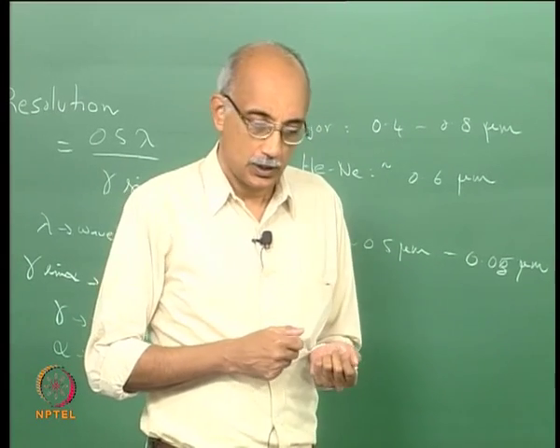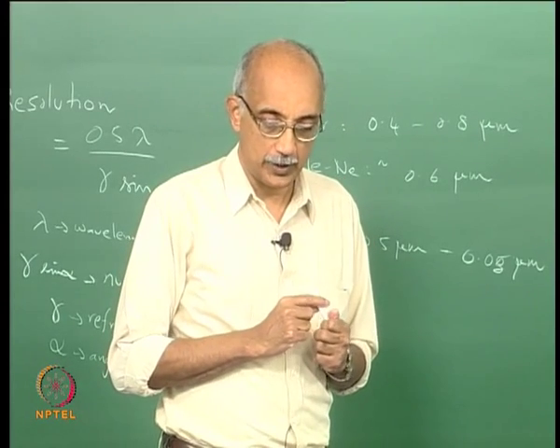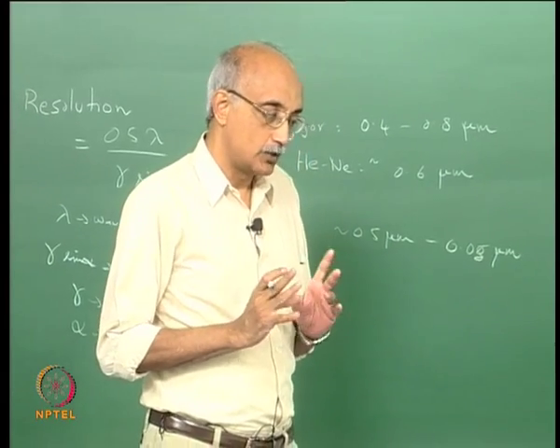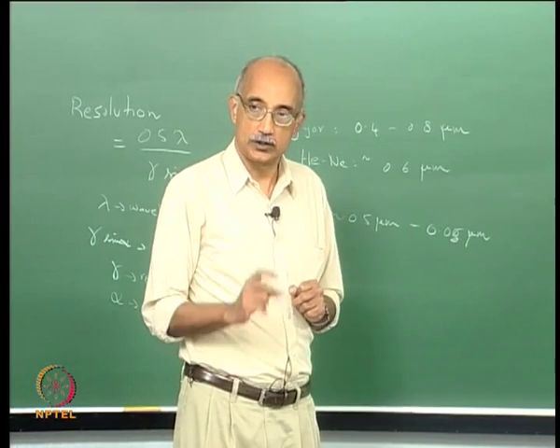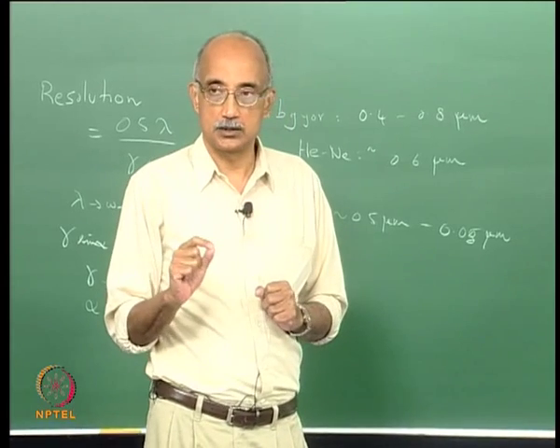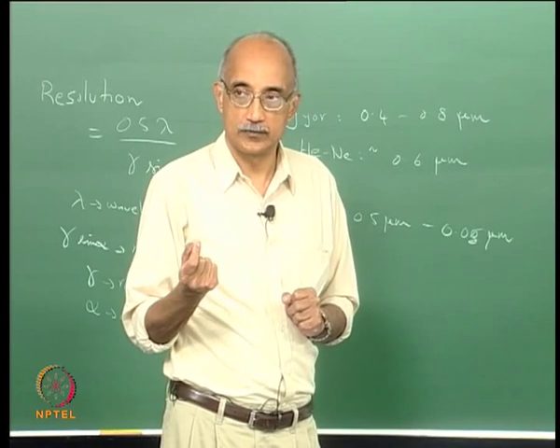And so, one of the tricks that are used in optical microscopy is that conventionally in what is known as bright field microscopy, you illuminate the entire surface with bright light, and defects and particles on the surface will then show up as dark spots.